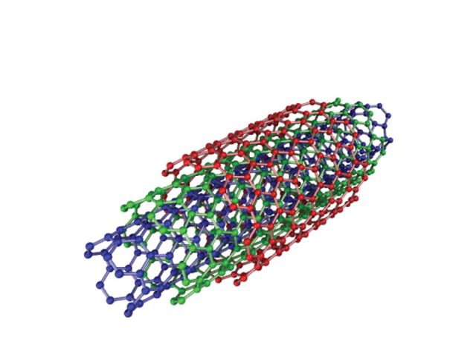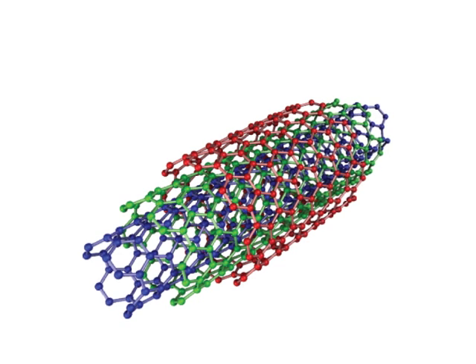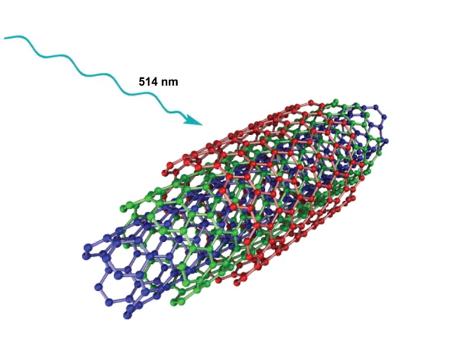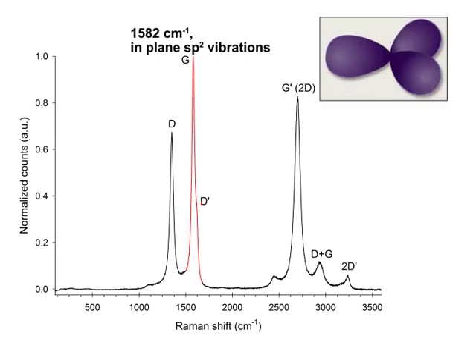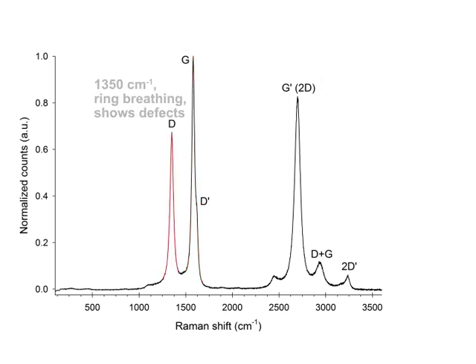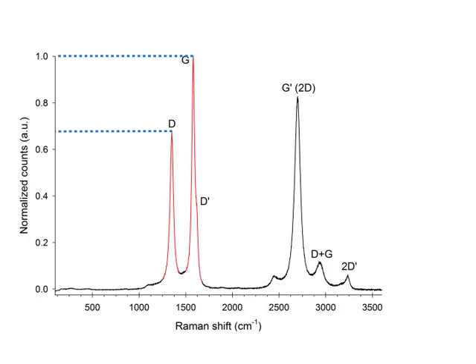Here, we'll examine the Raman spectrum of carbon nanotubes, which are very small, hollow, single or multi-layered rolls of graphene sheets. The Raman spectrum taken from multi-walled carbon nanotubes using a 514 nanometer laser is shown here. The G-mode peak at 1582 wave numbers is related to the sp2 hybridized carbon-carbon bond that can be found in any graphitic material. There is also a prominent D peak at 1350 wave numbers, representing scattering caused by a disorder in the crystal lattice. The ratio of the intensity of the G and D modes quantifies the structural quality of the nanotube.